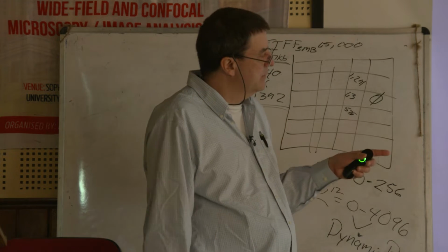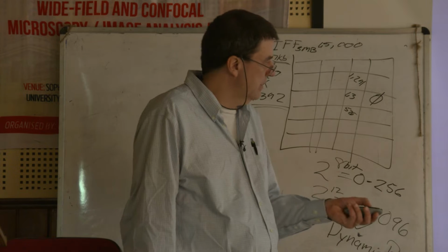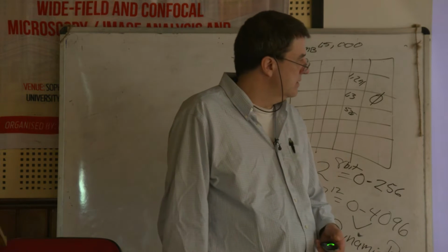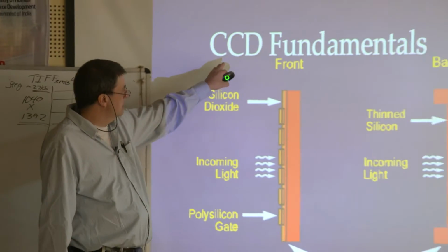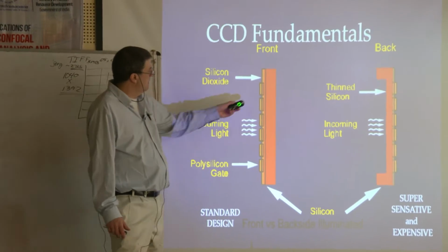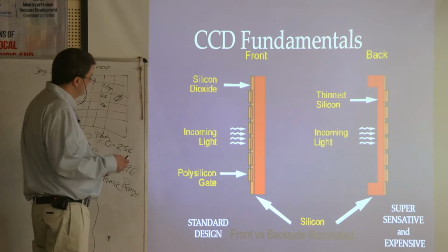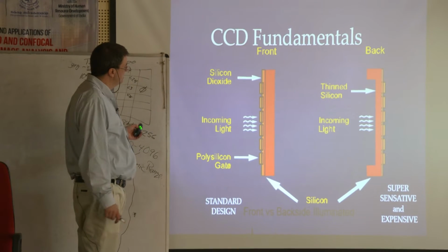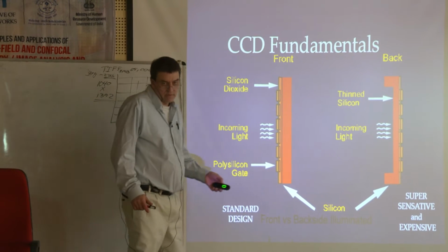So we're going to talk a little bit about some other things with the digital camera, and I'll use the whiteboard a little bit too. The chips we're going to talk about today are called CCD, charge-coupled device cameras. Basically it's just a bunch of silicon that the light hits. The photons, again, like we said, math. But the physical side of it is that the light hits this device and gets changed into electrons.